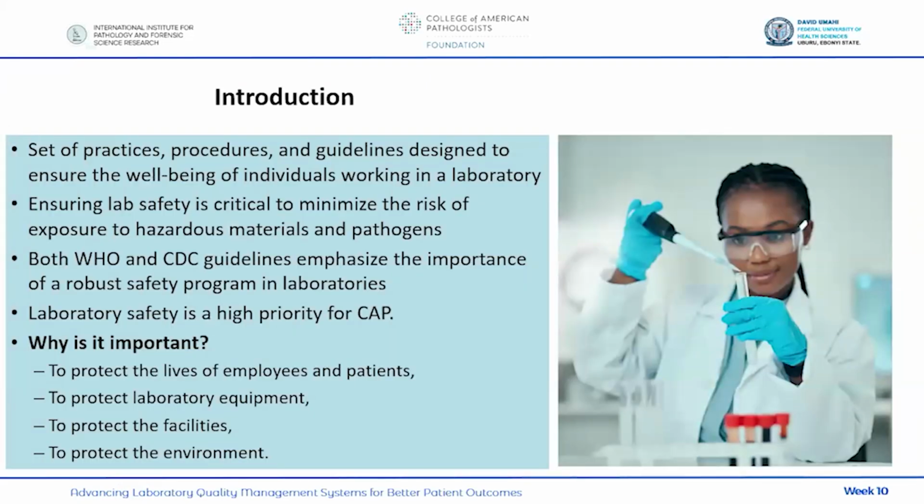So when we talk about safety in the laboratory, we are referring to the set of practices, procedures, guidelines designated to ensure the well-being of personnel who work in the laboratory, to mitigate any untoward occurrences, harms that may be waiting to happen to personnel who work in the laboratory. And you will agree with me that this assurance of lab safety is critical to minimizing the risk of exposure to these pathogens in the laboratory. And for this, the WHO and even the CDC emphasize the importance of a robust safety program in all laboratories. And of course, expectedly, it is equally a high priority for CAP.